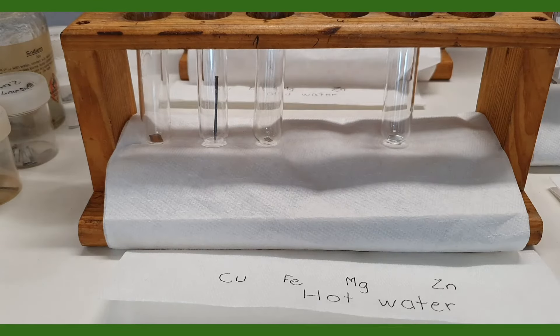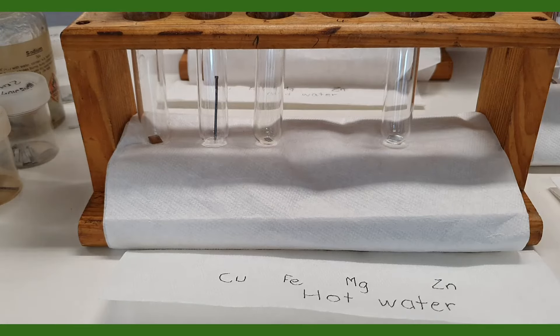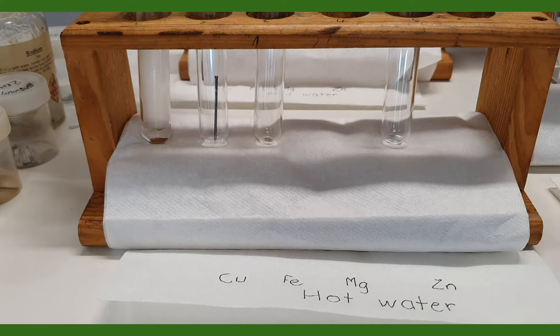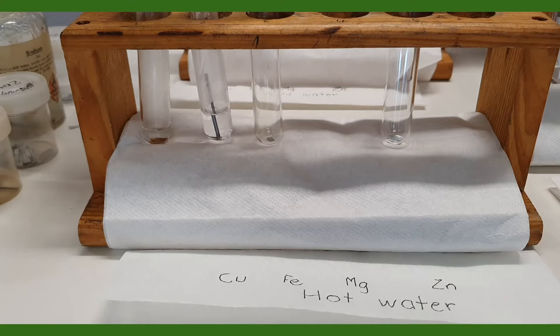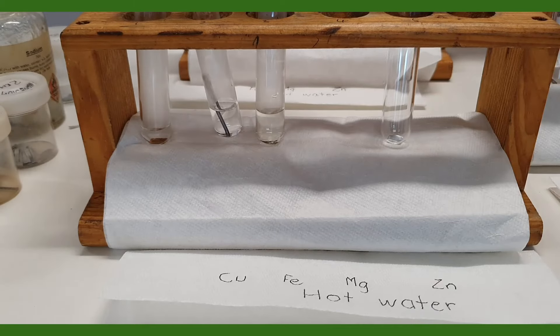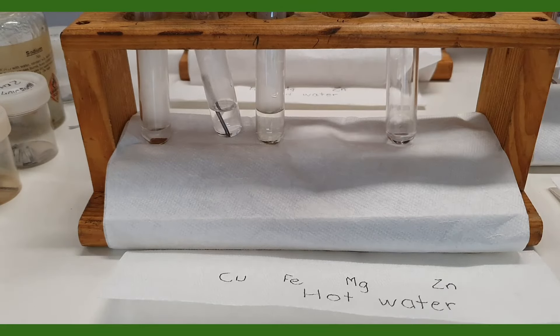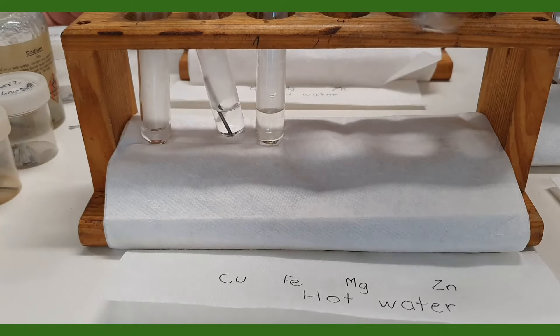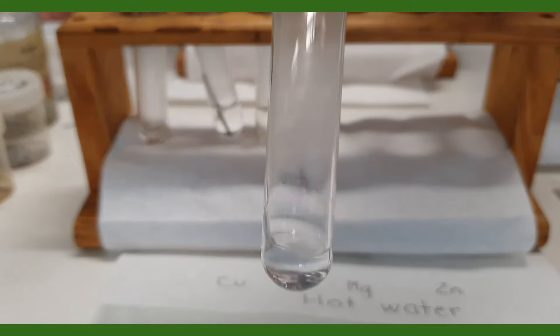I'm now adding some hot water to each of these metals — first of all there's copper, and secondly there's iron. This hot water I've just got out of a tap which dispenses boiling water, so it's quite hot, probably about 90 degrees Celsius. Let's put that up to the camera and see what is happening, if anything — so that is our zinc.